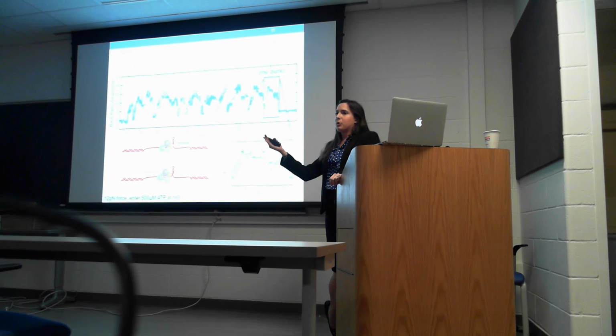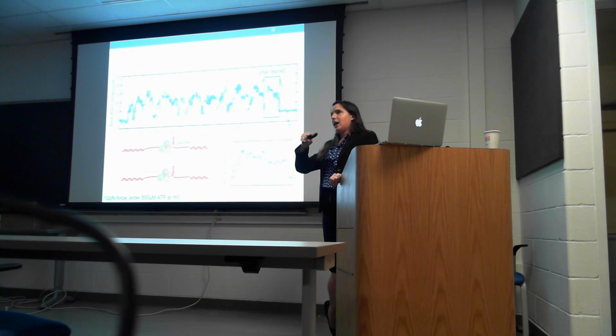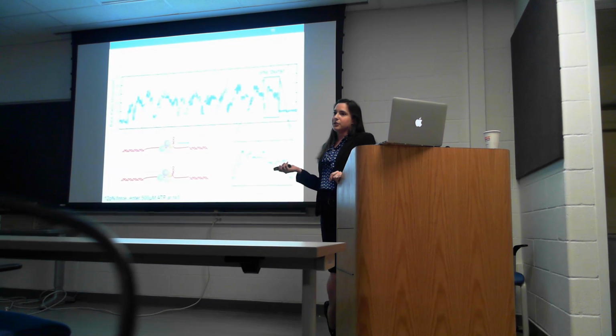XPD is just very prone to back stepping. You'll also see in the next few traces that XPD, I believe, strand switches.